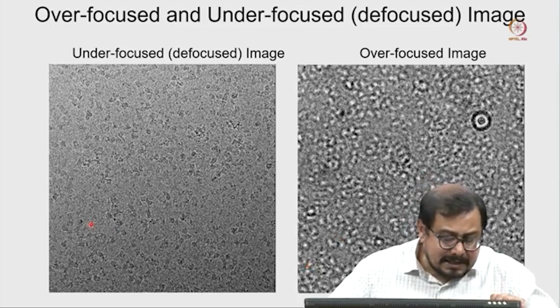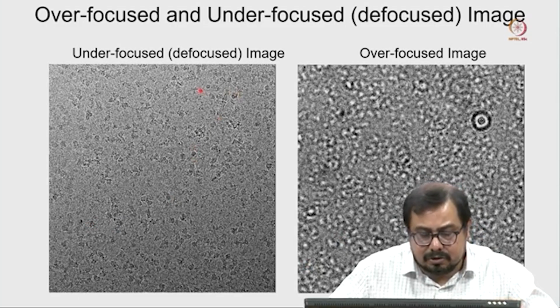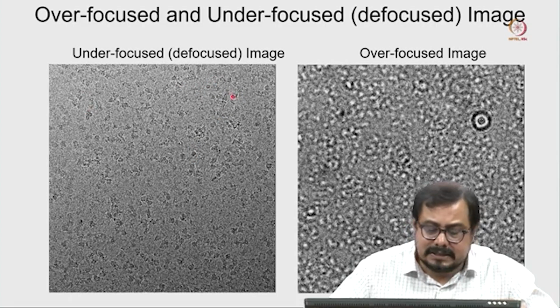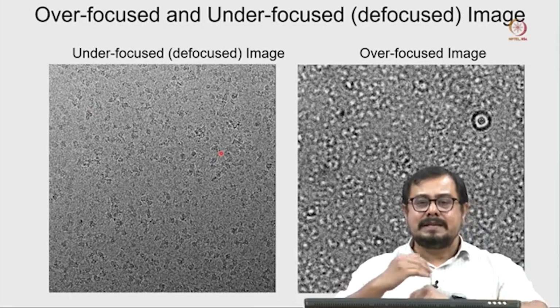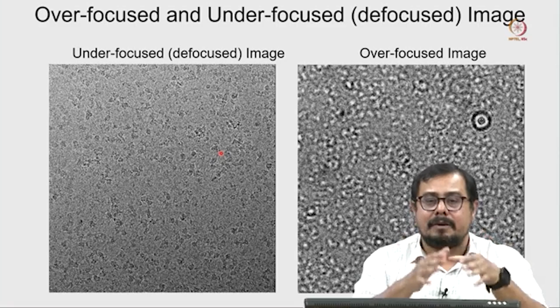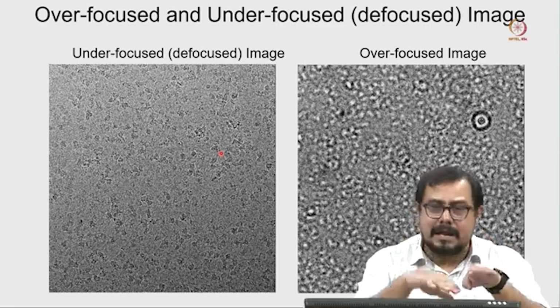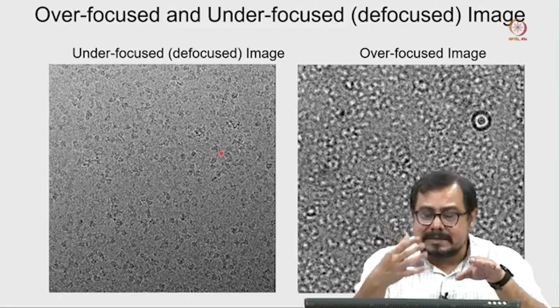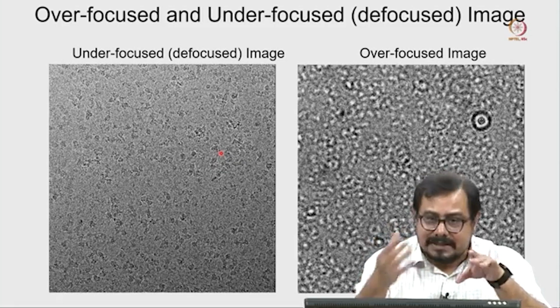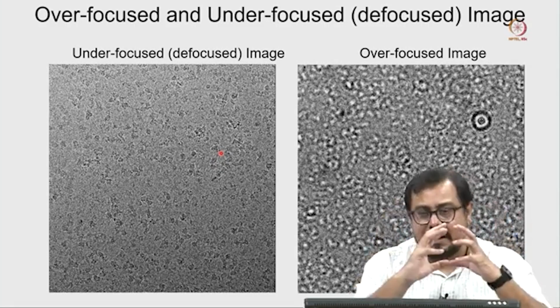So here you can see those black molecules are my protein sample, those I am pointing to. All over this is full of the protein sample. Why is this sample looking black? As I mentioned, in a cryo-electron microscope our sample stays inside the buffer, and if you compare buffer and protein, protein is much denser than the buffer and is completely packed.